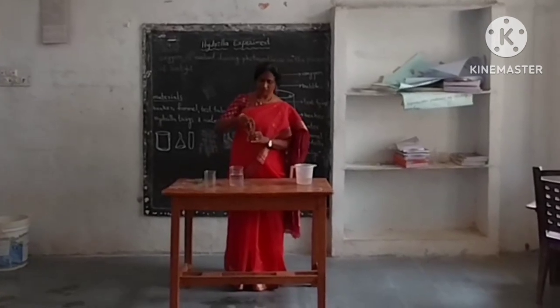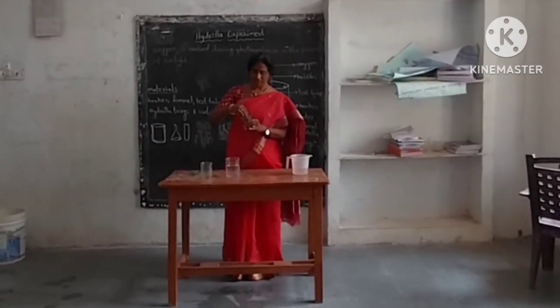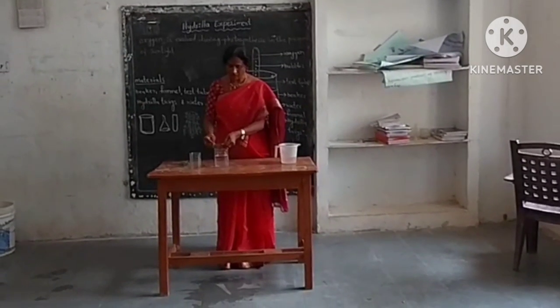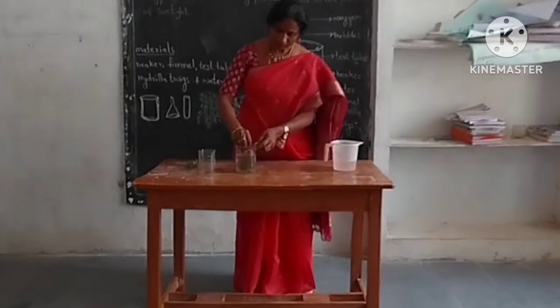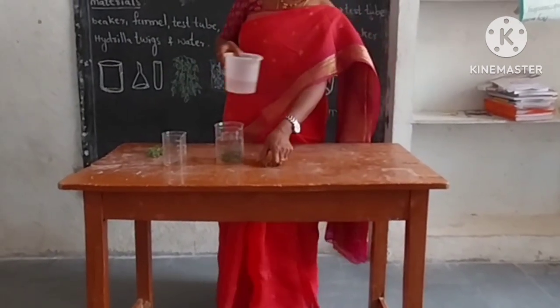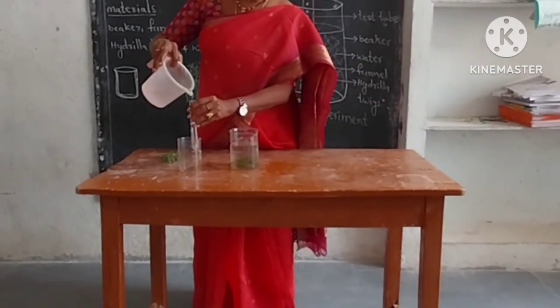Observe carefully. I am inserting Hydrilla twigs into the funnel and slowly dropping them into the beaker. Now, what am I doing?